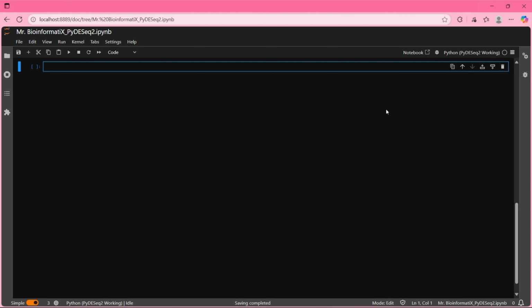So we will start by removing samples for which condition is none.